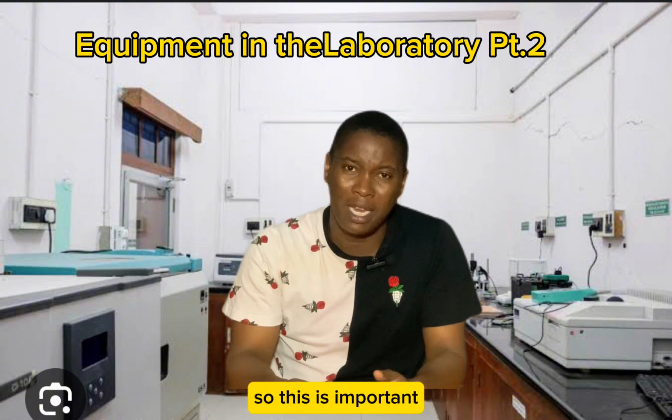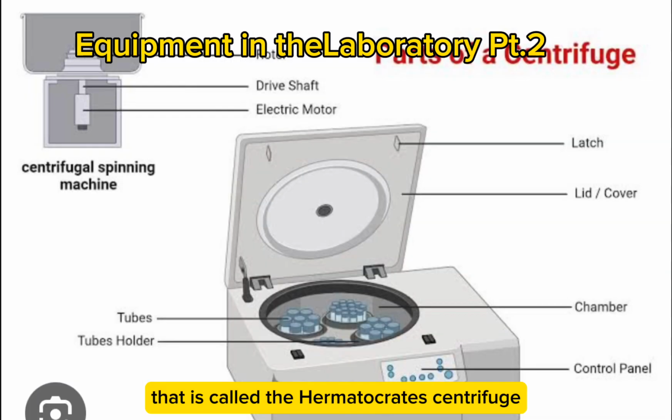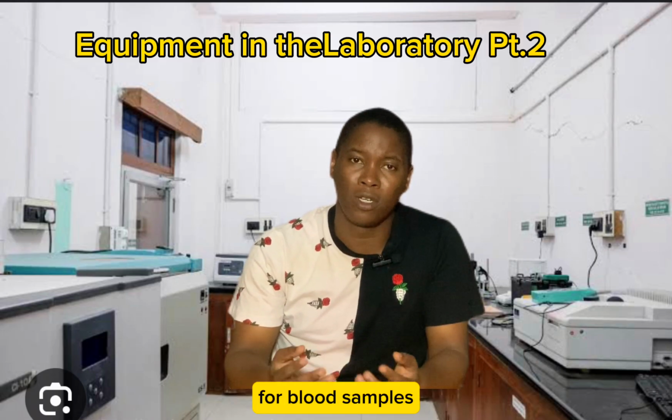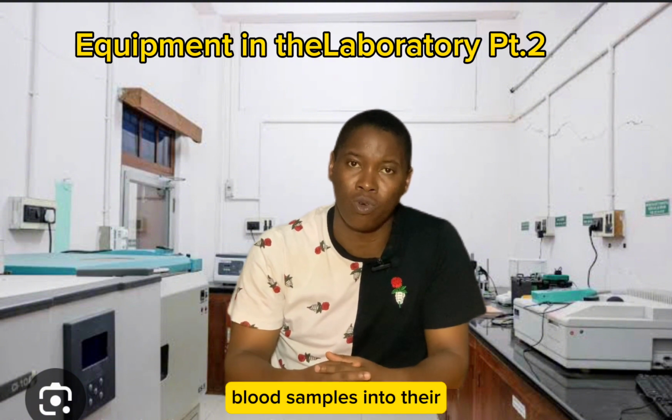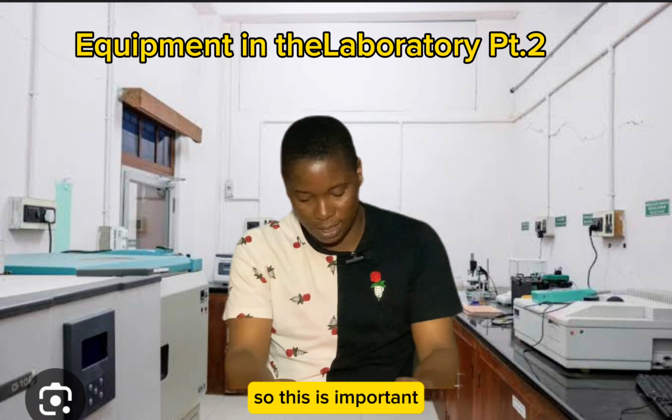So this is important. There's also a popular centrifuge that is called the hematocrit centrifuge. This is used by medical laboratory scientists and other scientists in the hospitals, and is also used for blood samples, to separate blood samples into their component parts and then to even give you PCV values. So this is important to note.